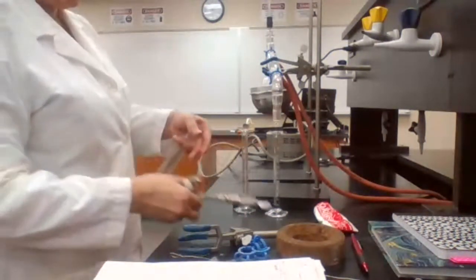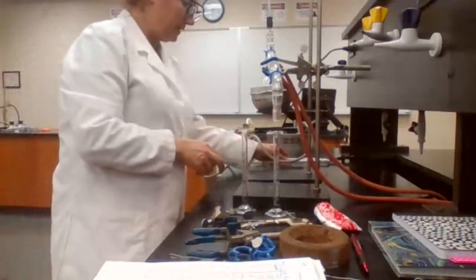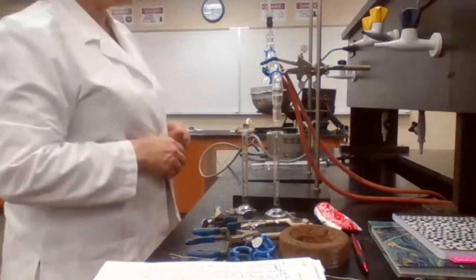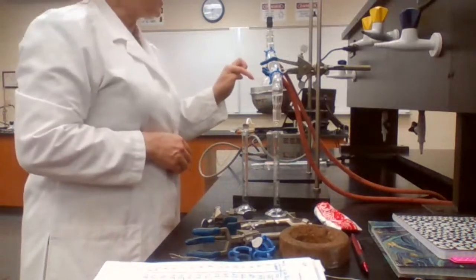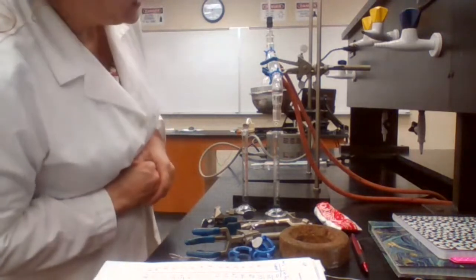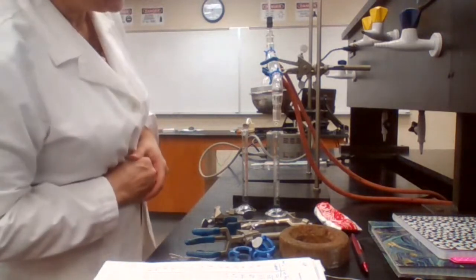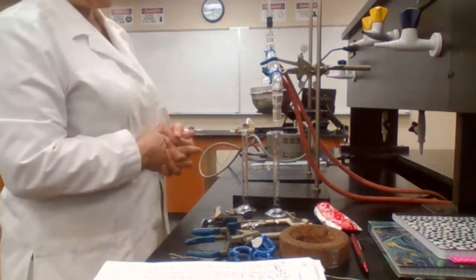And with 15 milliliters, I think we should be fine. We can stop the experiment at this point, although I'm going to watch if we can collect just 1 more milliliter. It's fine, but with the fractional distillation, we normally cannot go past 14.